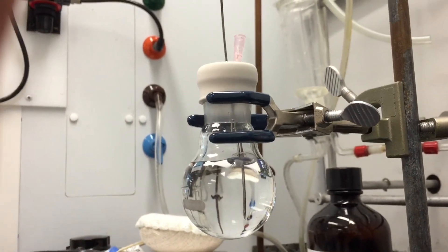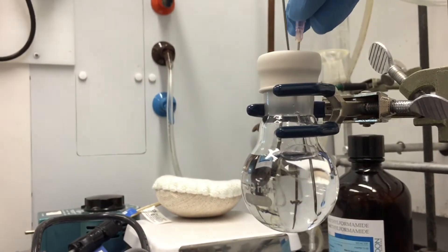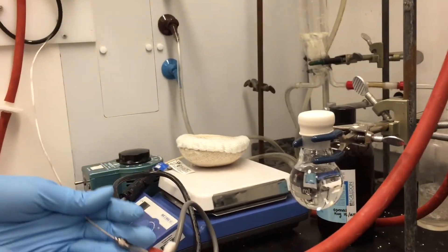You should degas your solvent for about 20 to 30 minutes before it's ready to use. Once it's ready to use, all you're going to do is remove this needle first. Now it's back to a closed system — you remove your needle and now you have your degassed solution.